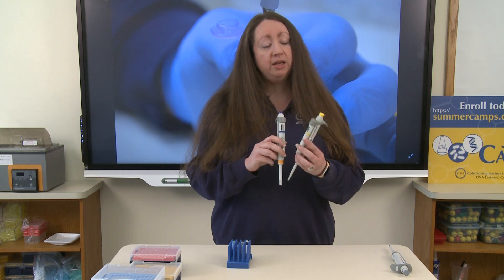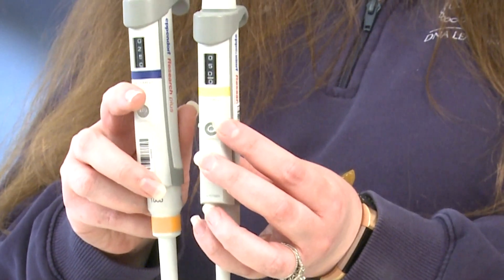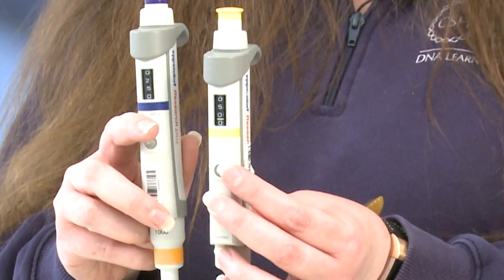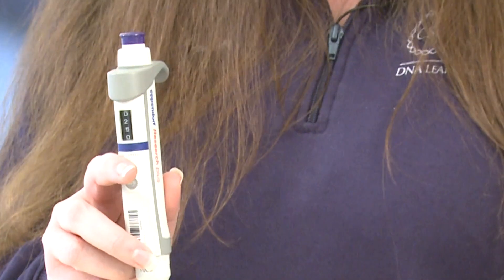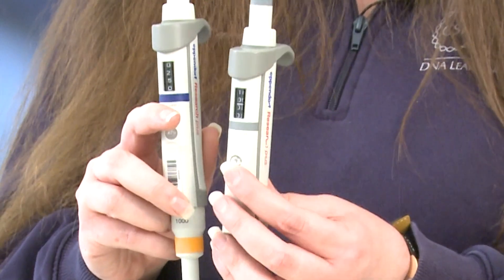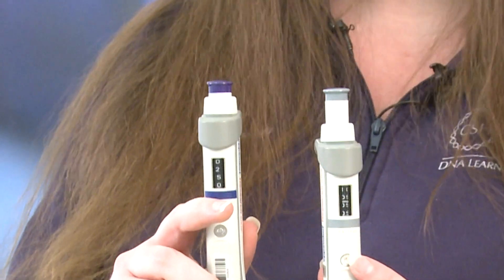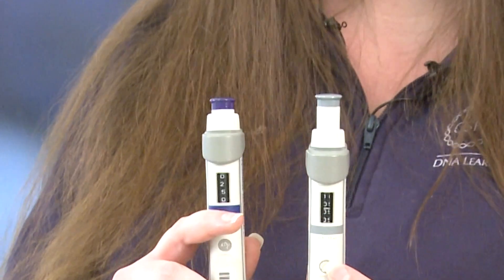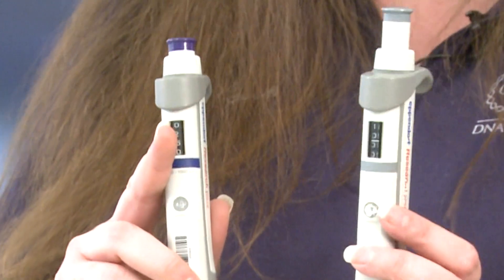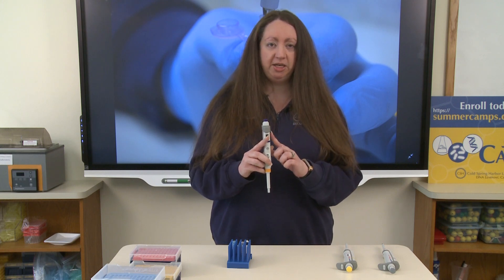How do we know the difference? In the window on the yellow micropipette, there is a line that runs through that window — that line represents the decimal point. So 025 decimal point zero equals 25 microliters on the yellow pipette. The same goes for the gray pipette: 0250 on the gray pipette would be 2.5 microliters, because that line is in the middle position. So that's how you know if you're setting the correct volume on these particular sets of pipettes.